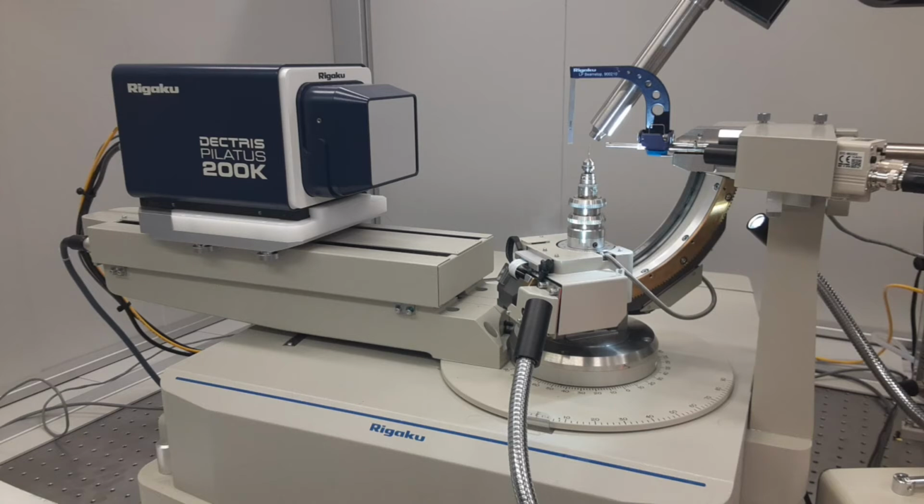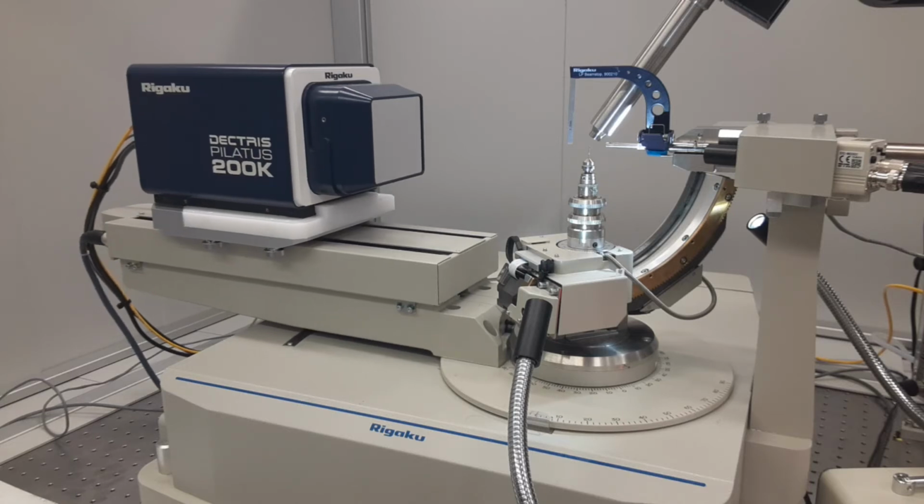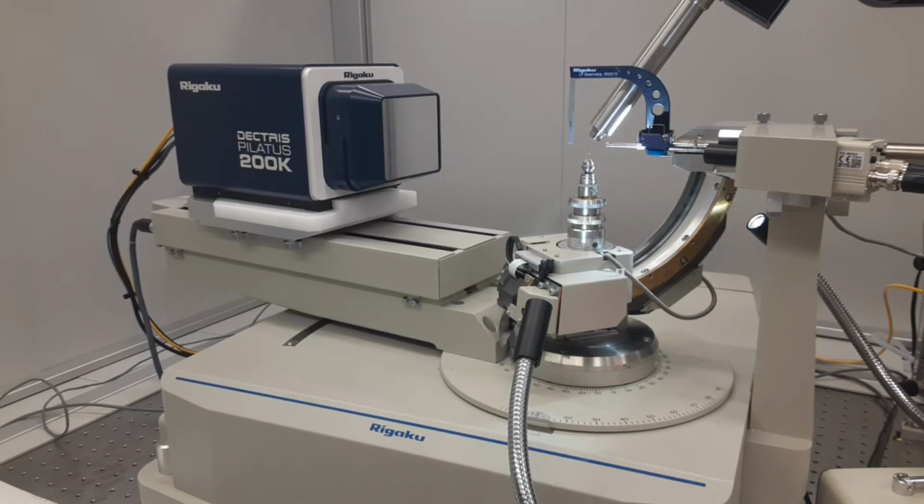Now what 2 theta does is it moves the detector itself, and this allows us to collect higher resolution data at the same detector distance. So now I'm moving 2 theta, and you can see it move.